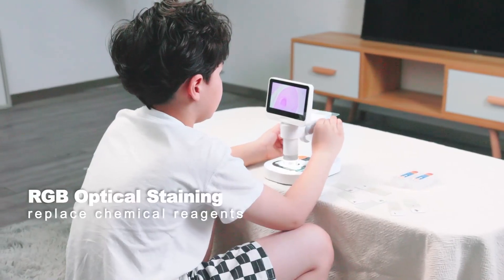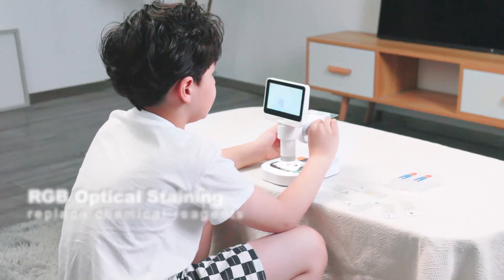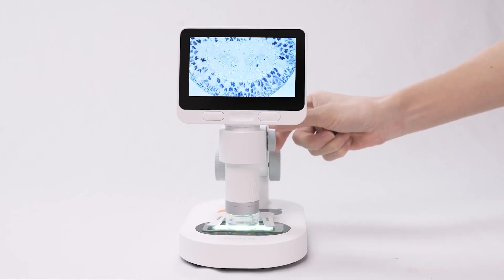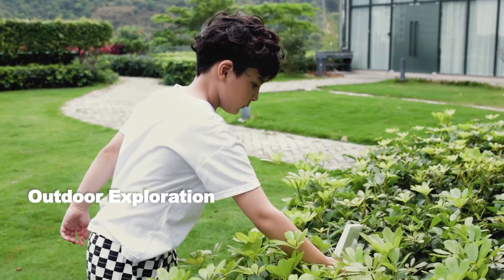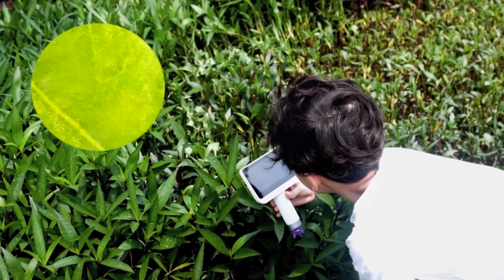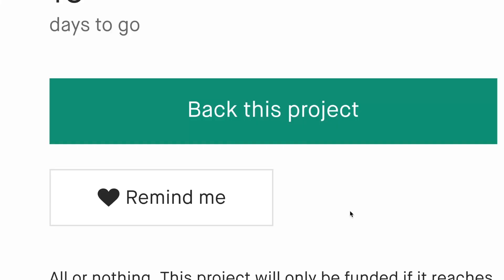Innovative RGB optical staining technology — rotate the knob to change different backlight colors. The compact single tube is palm-sized and detachable from the stand base, offering flexibility and convenience during exploration.